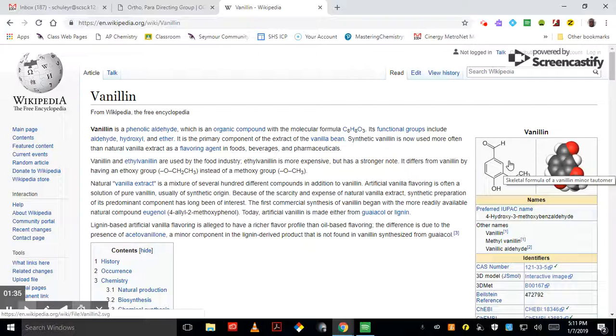He's found a way to add bromine to the vanillin compound, and you can see the structure of vanillin here. You can see that this is a benzene ring, and it has 3 substituent groups on it. It turns out that these substituent groups will decide where that bromine goes. If you'll notice, we have 3 possible compounds. We could put the bromine here, here, or here.